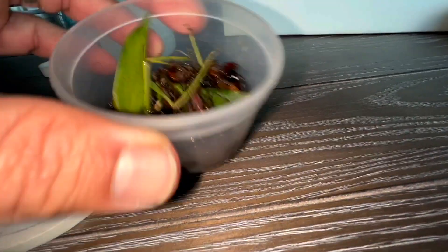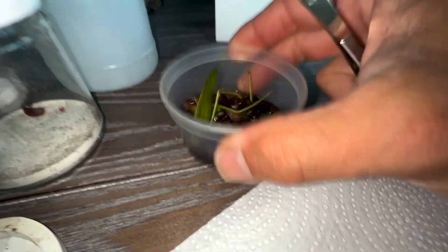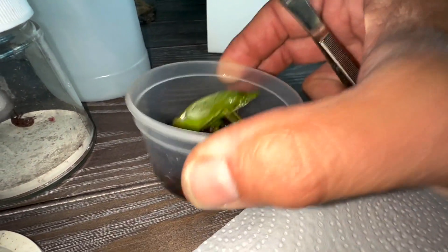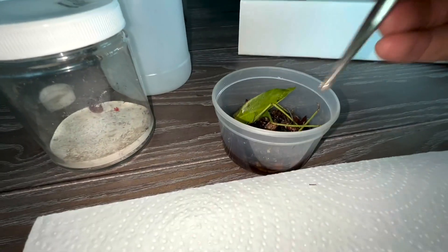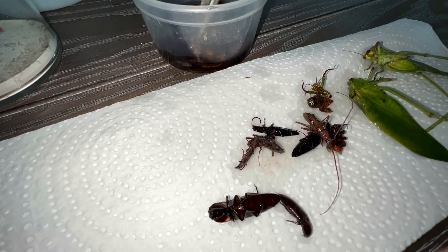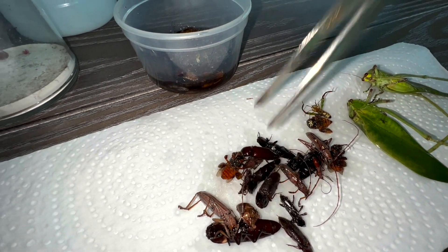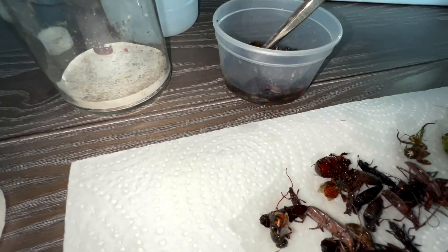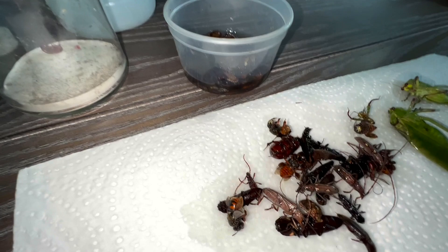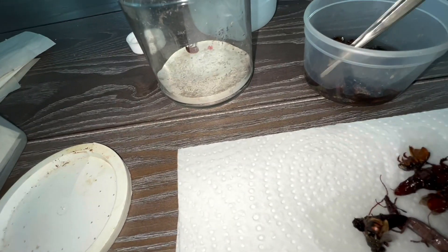What that does is it gets all the moth scales off of them — kind of gets them cleaned up. I can take them out, put them on a piece of paper towel, let the alcohol dry a little bit, and then we'll pin them up and see what we have. Especially when you're putting beetles and stuff in the kill jar that you usually use for moths, one of the side effects is you're going to have moth scales all over your beetles — moth scales come off in the jar. So we're going to do away with all that.